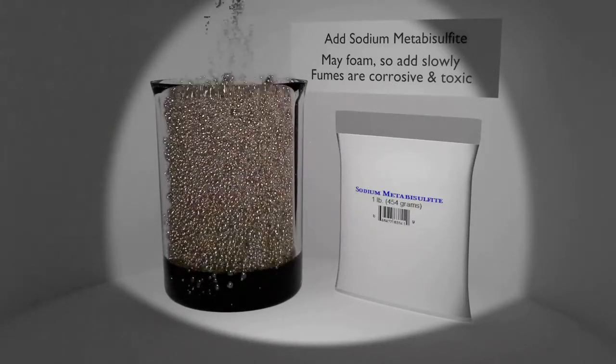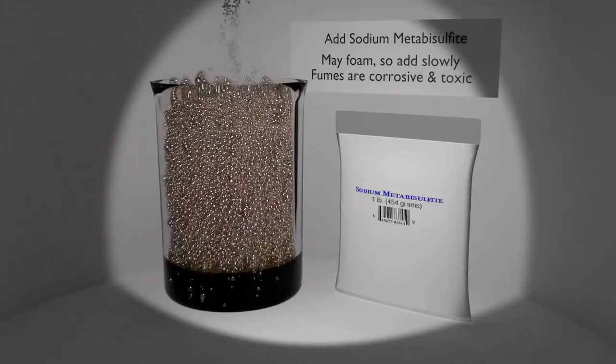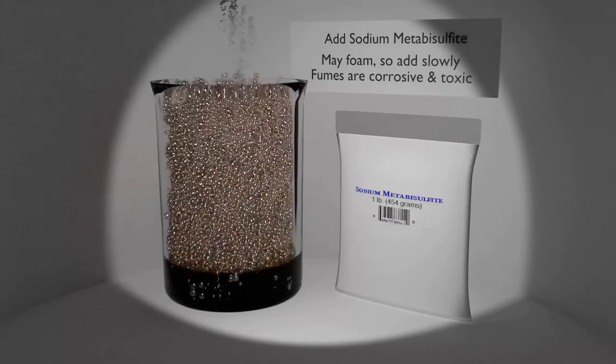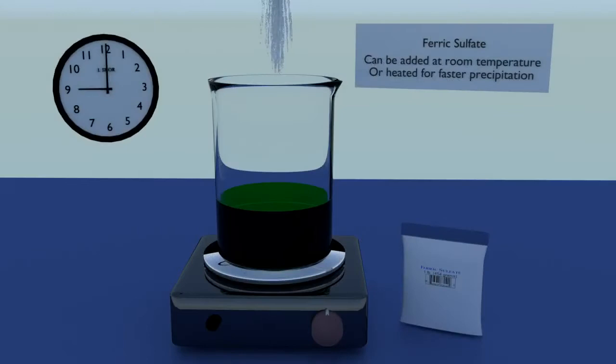Ferric sulfate: this is an odorless precipitant that can be employed at room temperature, or the solution can be heated for more rapid precipitation.